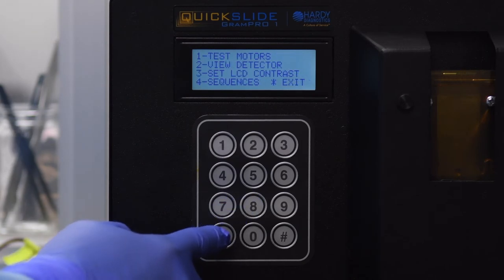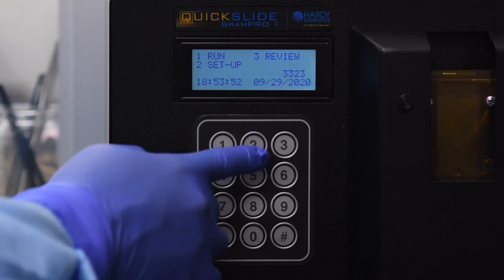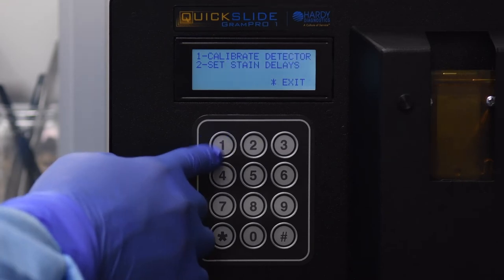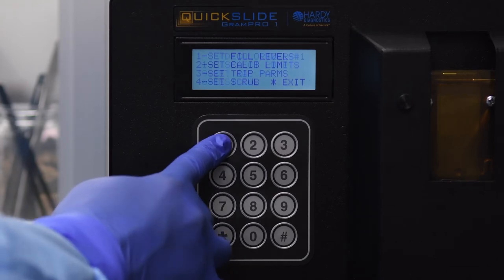To ensure this process was done correctly, press 8 on the main menu to access one of the service menus. If you see the following screen, then the password has been entered correctly. Press the star key to exit back to the main menu. Press 2 to select Setup, press 1 to select Calibration, then press 9 on this screen to access a service menu.